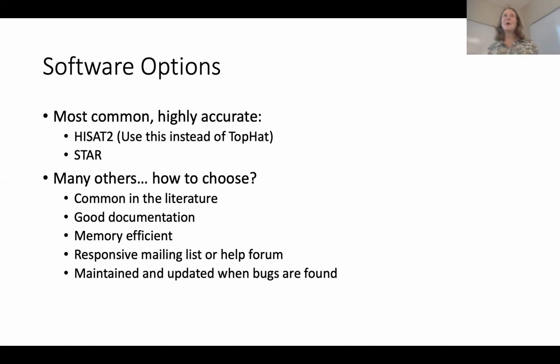If you go to the TopHat homepage, it says, we've rewritten it, we're no longer maintaining TopHat, it hasn't had any updates in over 3 or 4 years. Please move to HiSat2. So that's what I'm telling you, move to HiSat2. STAR has been around for quite some time. It's still being maintained. It's very fast. It's very accurate. And that's one we're going to use in this class.